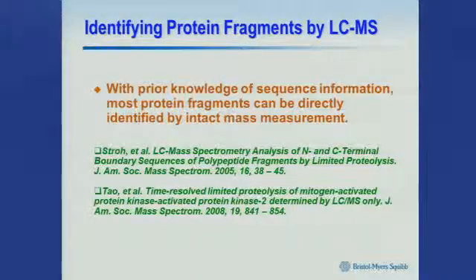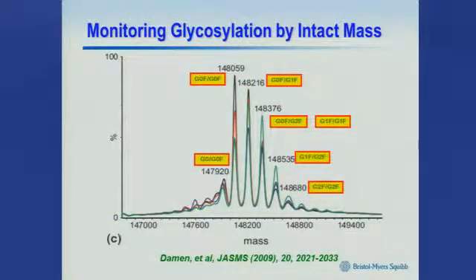So nowadays, if you know the sequence of the molecule, and you have some fragment, just by simple measurement, and with some assistance of pattern matching, you can pretty much figure out where it started, where it is sequence-wise. There are two papers talking about this. One is from us, which highlights the really quick, accurate turnaround of this technique.